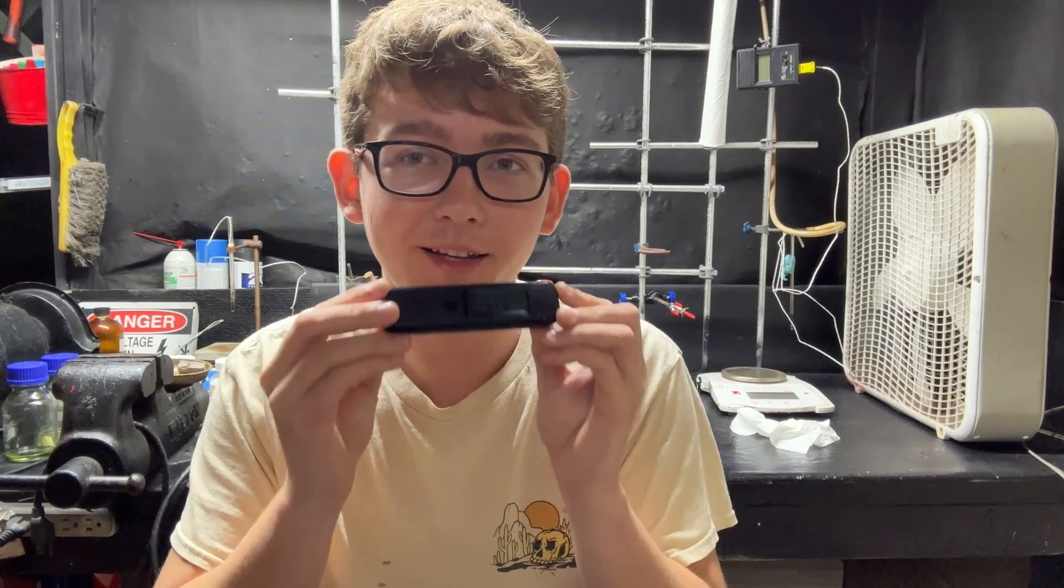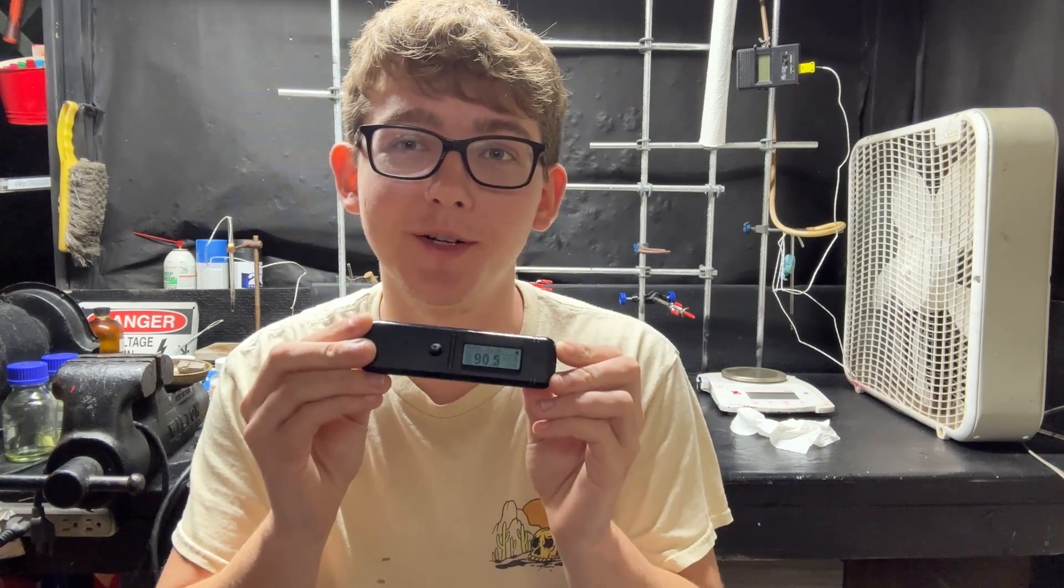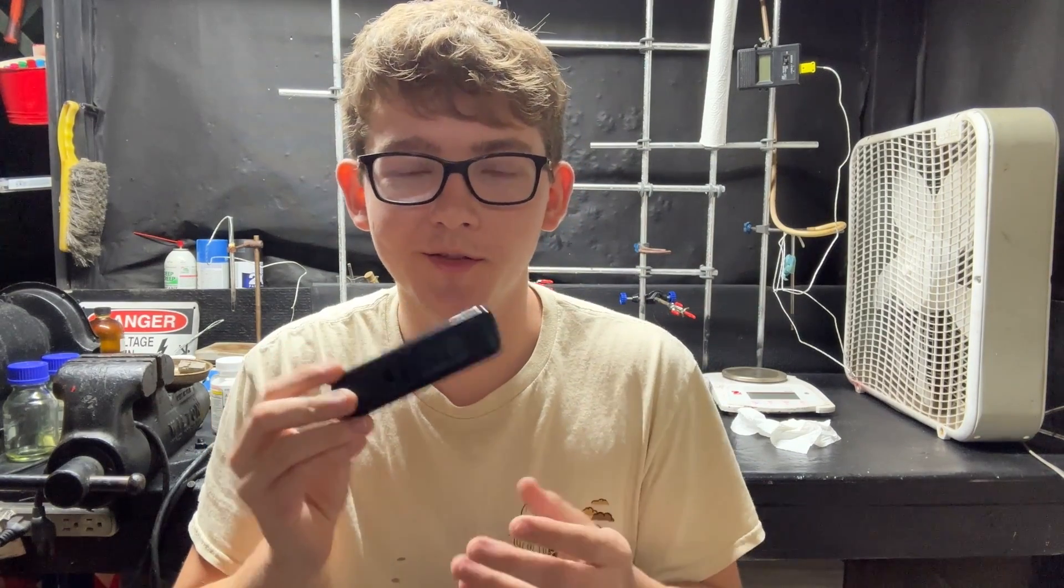Why? Because this isn't just an ordinary Geiger counter. This device right here is a pocket gamma spectrometer. So what is a gamma spectrometer and what does it do?